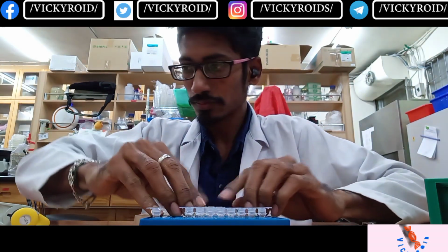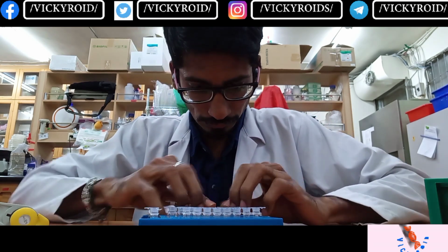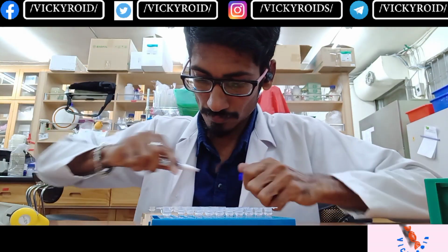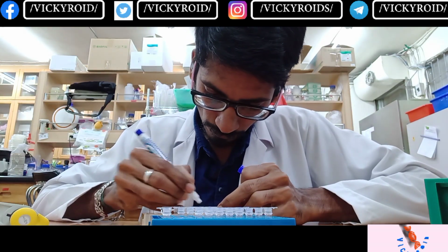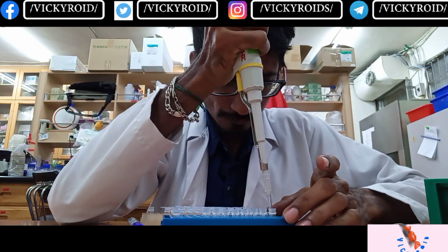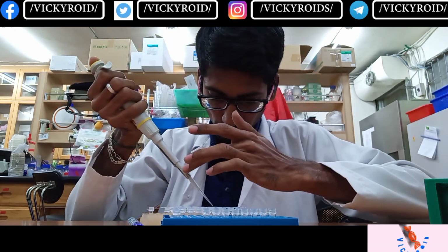So the first 8 samples have been added. I'm going to add the rest of the samples. Sample number 9 to 16.